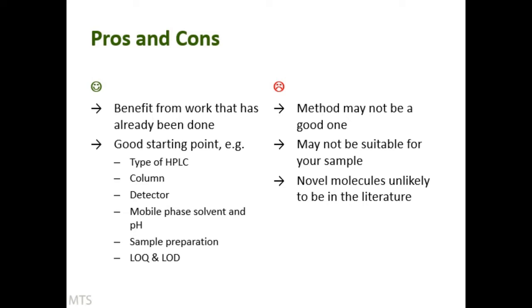I see a lot of methods in the literature that are really quite awful. And what you could do is create something much better in terms of resolution, separation, on more modern instrumentation, maybe using a UHPLC, maybe using much quicker and cheaper reagents and instruments. So it's not always perfect.